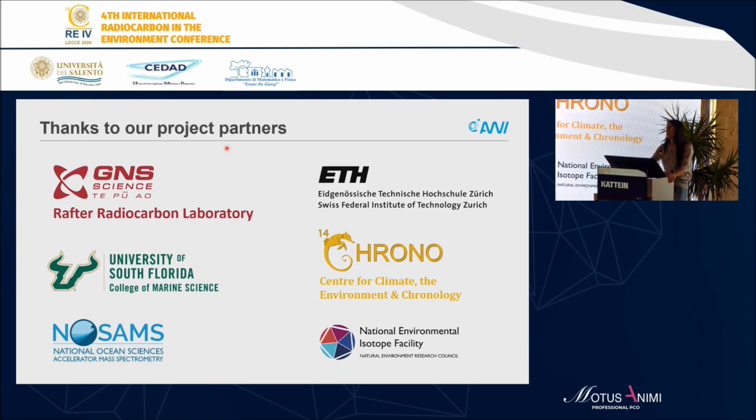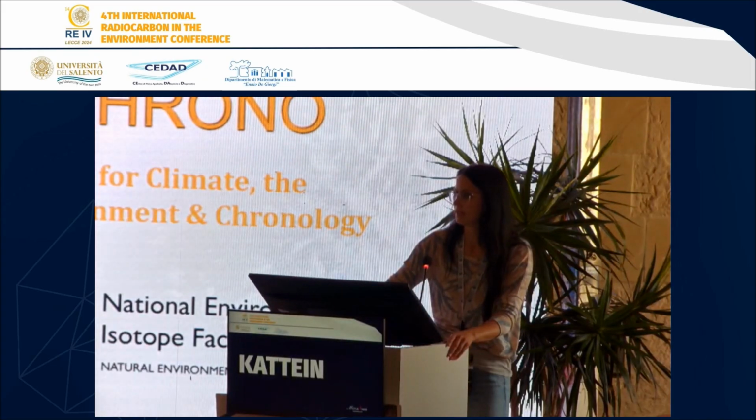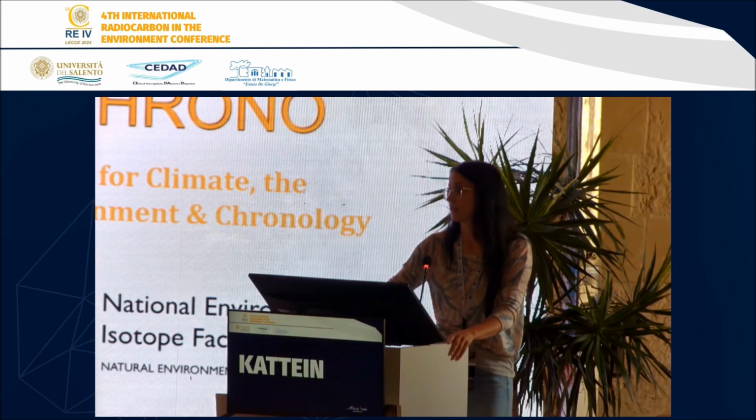Not the background and not the oxalic or the standard. Do you have some results that you reproduce? We have results. I haven't plotted them here, but we have measured one sample about 70 times, and we have a really good reproducibility. Unfortunately, I would like to show you the plots to prove that, but we have definitely looked at that, and this is one of the main concerns, to be able to reproduce our measurements, but that's one of the advantages of a commercial system, that it's much easier to reproduce the data.